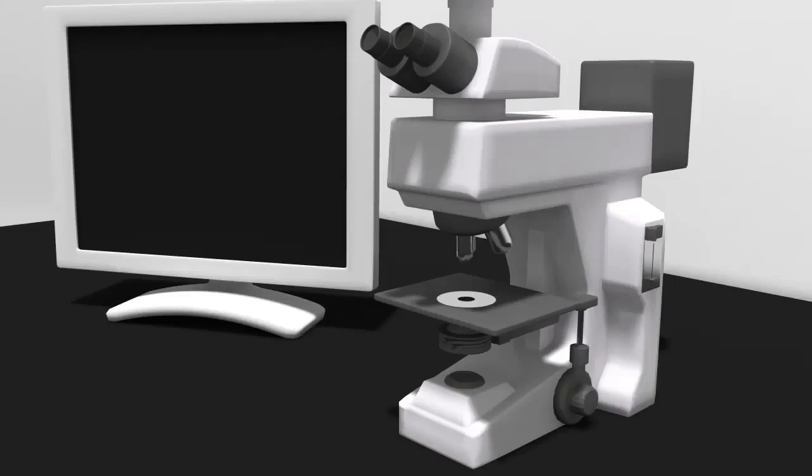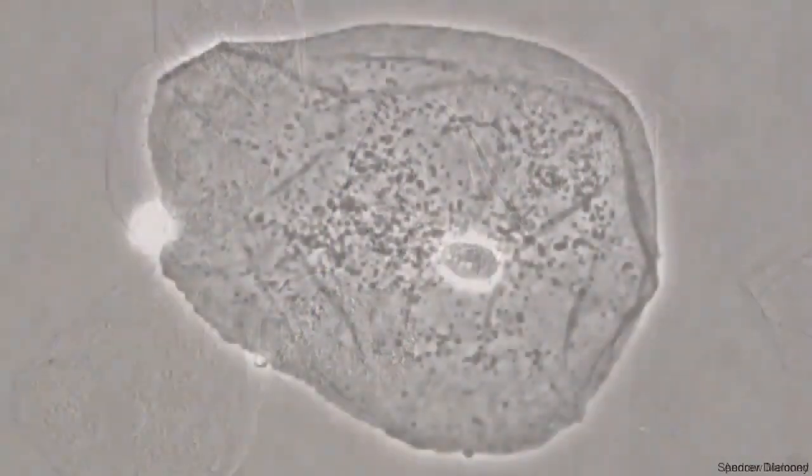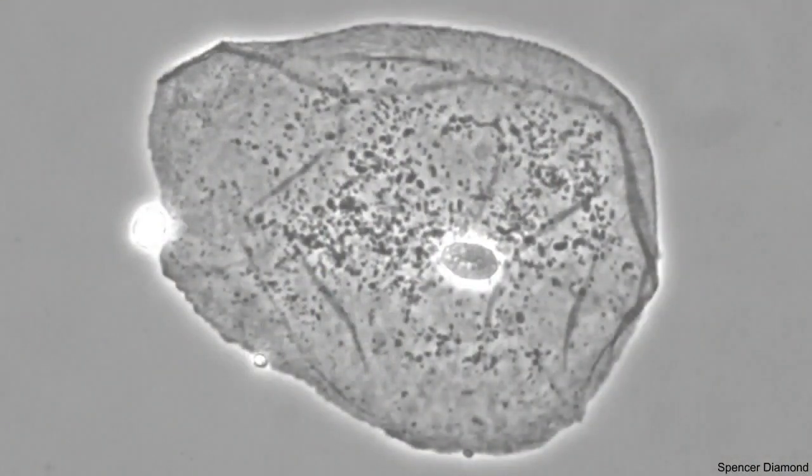A microscope is used to view many different types of samples, including cells growing in tissue culture, tissue samples, or whole organisms. While cells growing in tissue culture can often be simply placed upon the microscope, other samples need to be prepared and processed prior to viewing under the microscope. Many samples that a researcher would like to examine under the microscope are transparent and lack sufficient contrast to view a sample. Phase contrast microscopy can be used to view such transparent samples, such as unstained cells growing in tissue culture, as it increases the contrast of a sample.